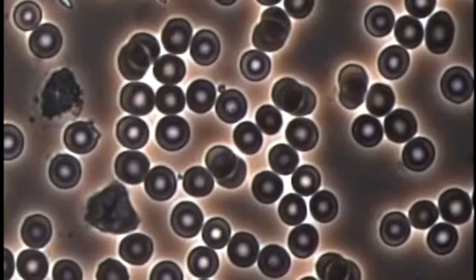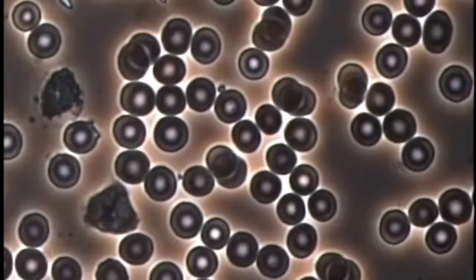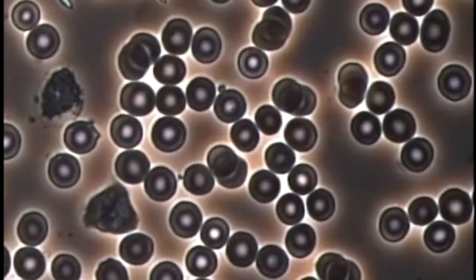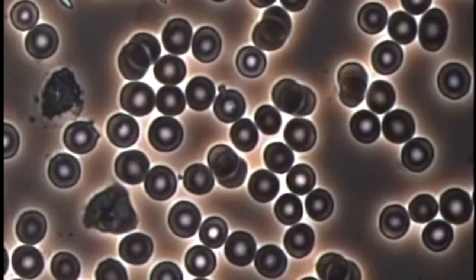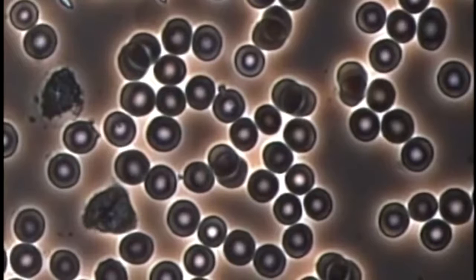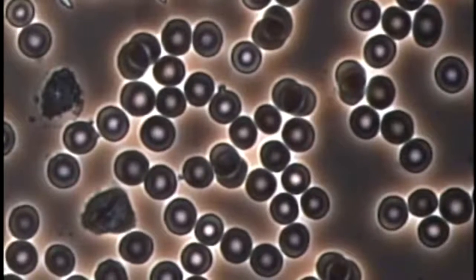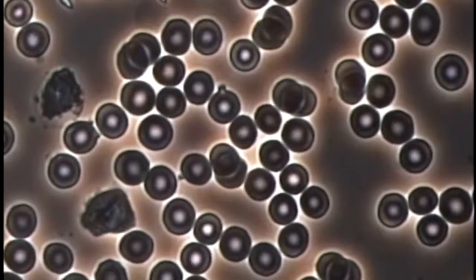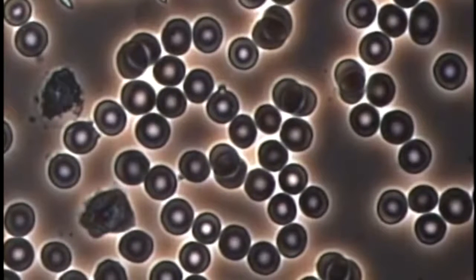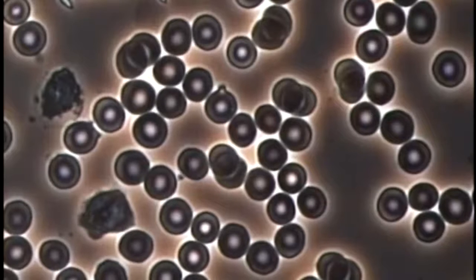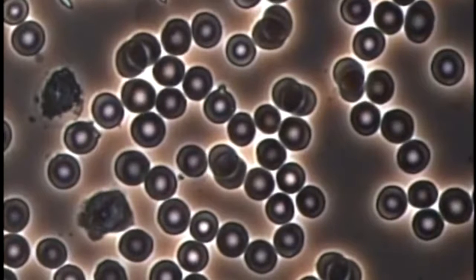Now, this is after five days. There's no more bacteria in the background. Almost none. Now, the red blood cells are a little pale in the center. Even though they're separate from each other, which is a major improvement, they're still not dark enough. That means they don't have enough hemoglobin. They're pale. Therefore, they're anemic. This patient is still anemic.